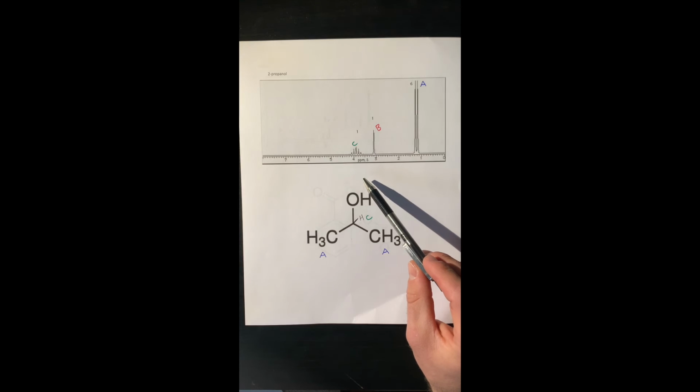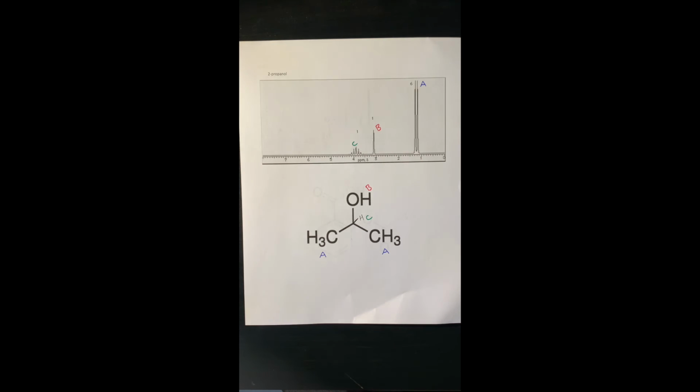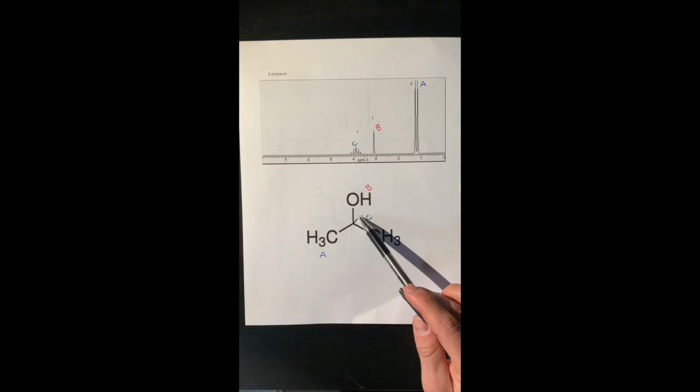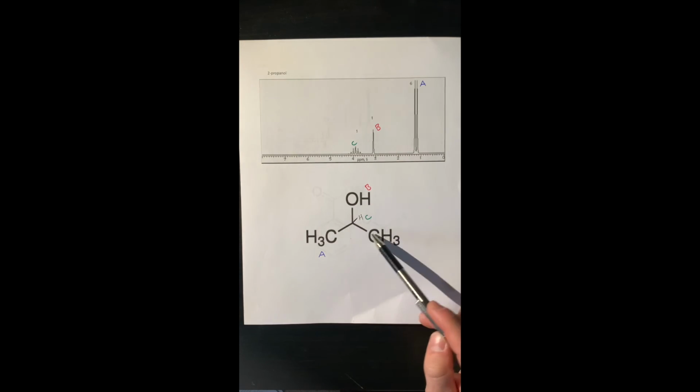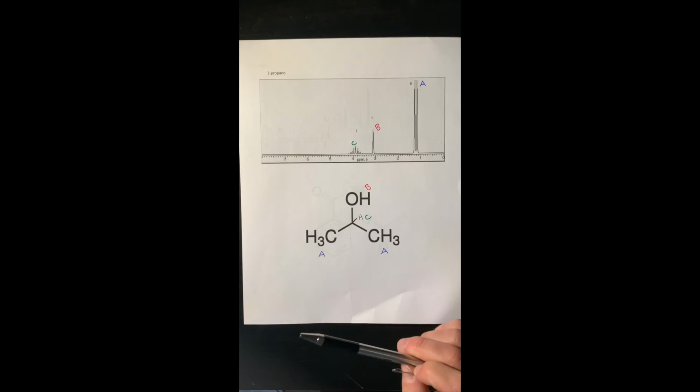And based on the structure, we're looking for a hydrogen that has no adjacent hydrogens to couple with, which would give multiple signals. And so what's left is these two hydrogens here. So this hydrogen could couple with either of these. And this hydrogen is bonded to the oxygen, which has no other hydrogens on it. So it can't couple with anything.